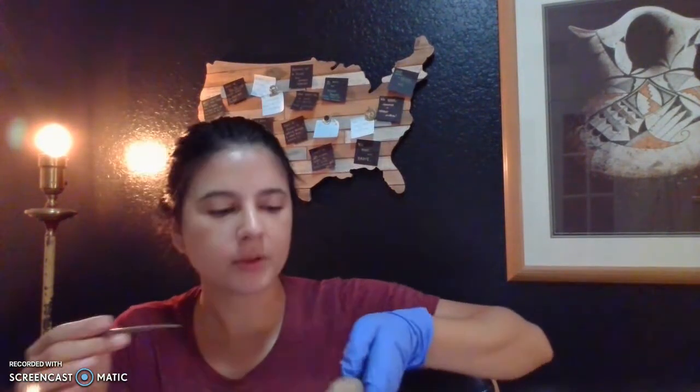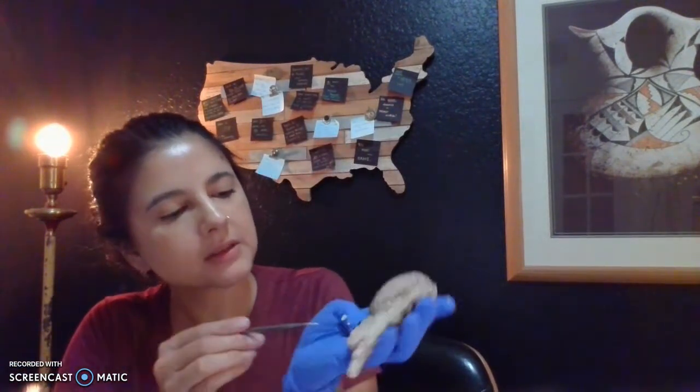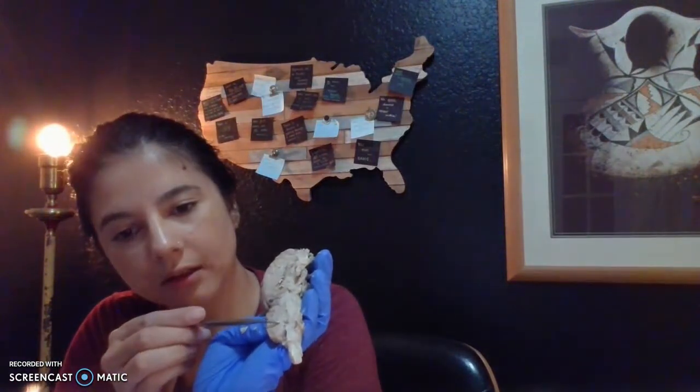The cerebral cortex is lining the thin layer here. White matter can be seen right there. And then the meninges is what we cut off.